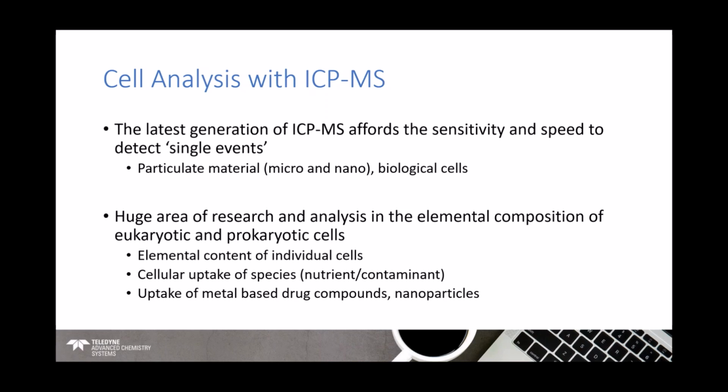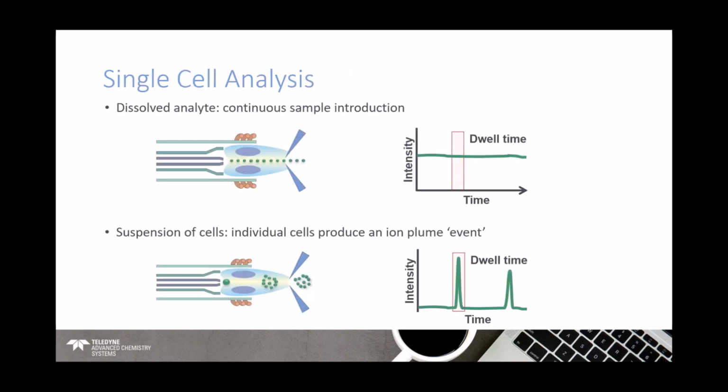So how does this work? Typically, if we ignore solid sample analysis with something like laser ablation, a majority of sample analysis in ICP-MS is undertaken with liquid sample introduction. What you typically have is a homogeneous or close to homogeneous liquid sample, and that sample is introduced to a plasma, an ICP, in an instrument via a nebulizer and spray chamber with some sort of automation.